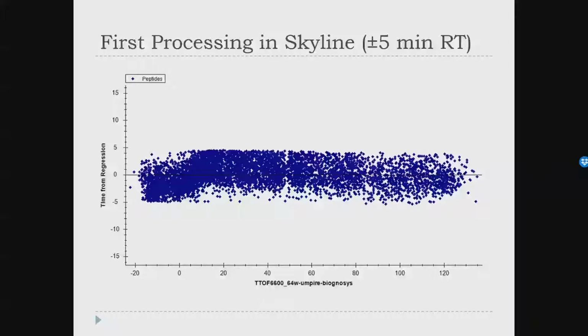Those query parameters contained a spectrum, or just relative intensities of all the fragment ions, as well as a retention time, or a normalized retention time called IRT, that would help the software find your peptide again. So those are the 2 pieces of information that get put into those query parameters.